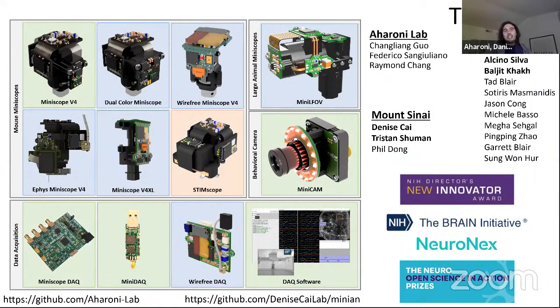We are generally interested in building things where we ourselves, or a close collaborator, have some hurdle in the way of doing their research, and then we like to work with them to address that hurdle and design systems around it. And we just haven't had a close collaborator that needed a system like this for small animals or for songbirds. Otherwise, I think it's very doable even for our platform. But again, there are open source systems that exist that are a really good fit and are already under 2 grams.